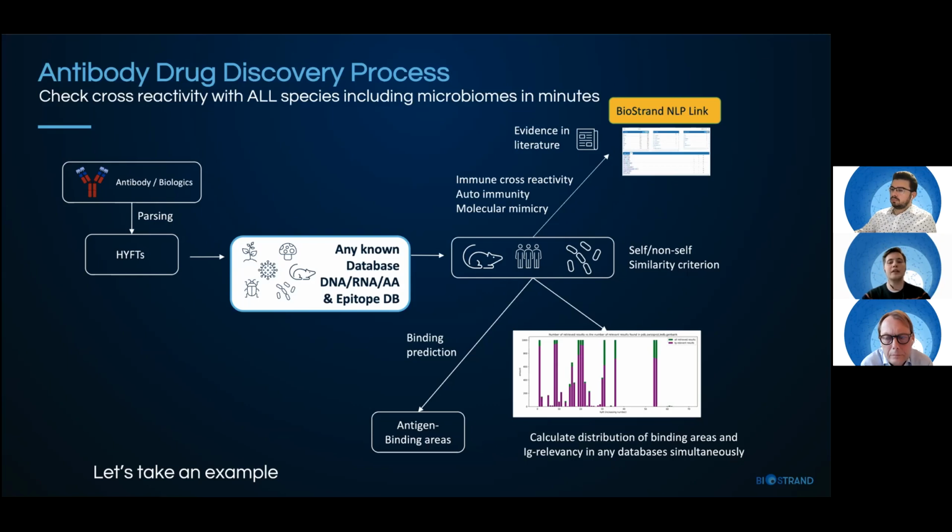The beauty is, because we have everything integrated with our machinery and our pipeline, that's no longer a problem. So that means that, for instance, in case of any search, you can also take into account overlaps with bacteria, overlaps with viruses, and any other sequence you have a relevant association with. Remember again, and also in regards to what Sébastien explained, at the end of this analysis where we assess whether the epitope has an overlap with the proteomes, whether it's human proteome, rodent proteomes, or any bacteria, we can do a sanity check and see if, based on these concepts, we can find something in the documentation, in the scientific literature, that could point to relevant associations that can help us make sense of why we've picked up this association.